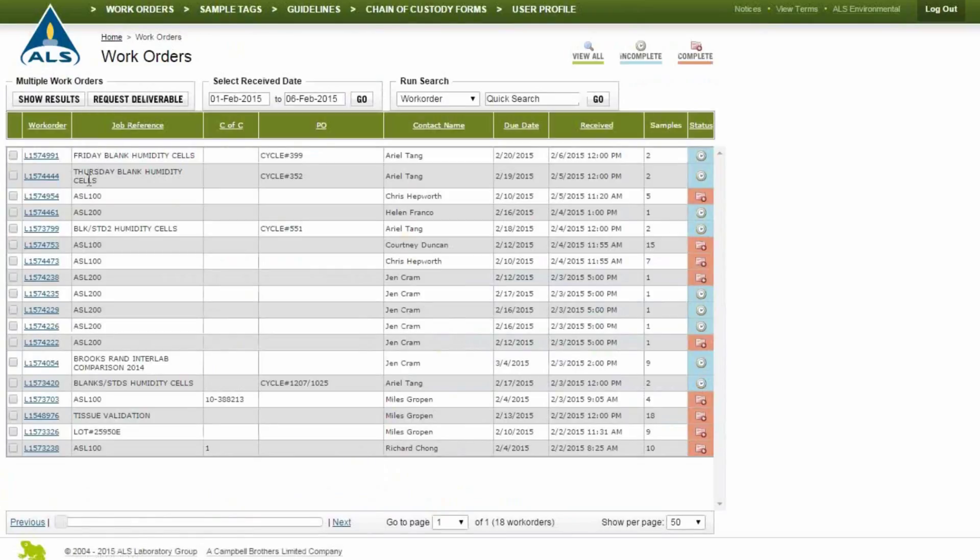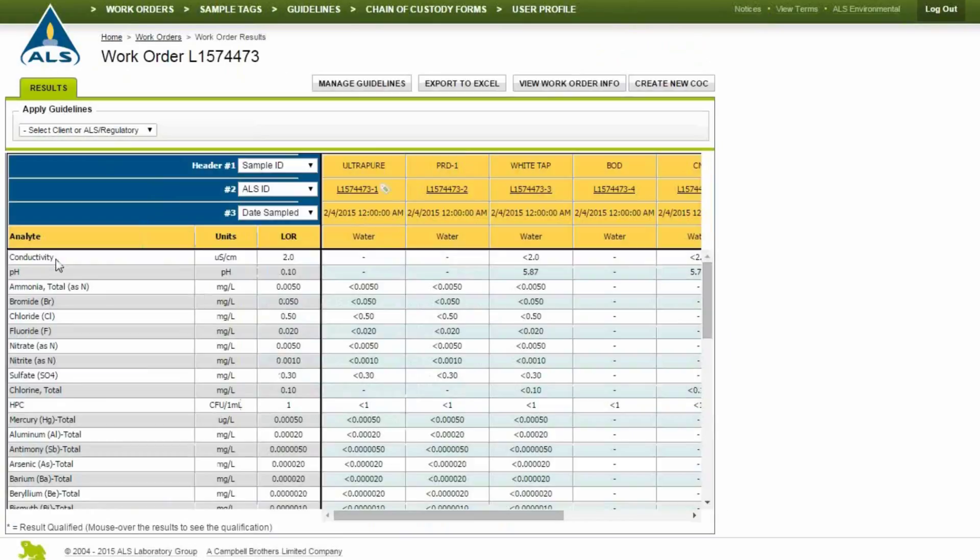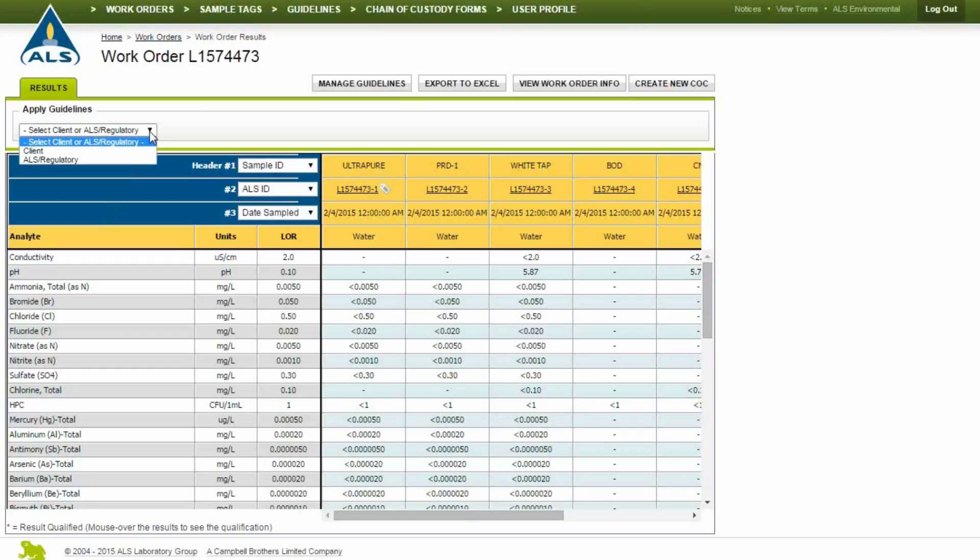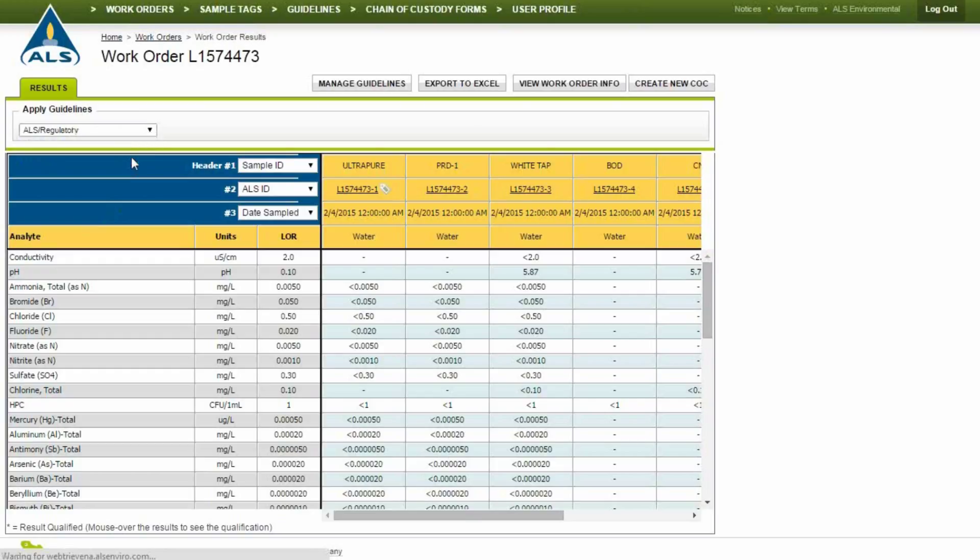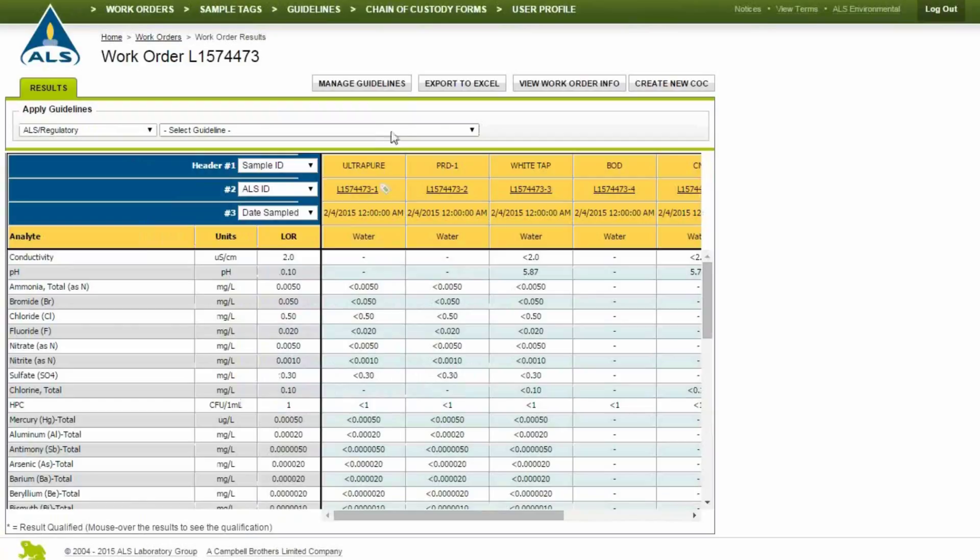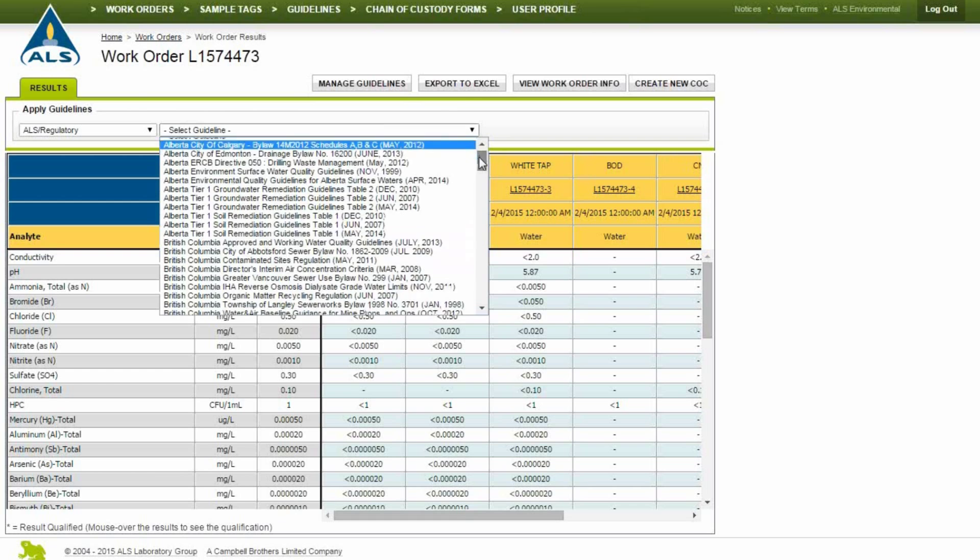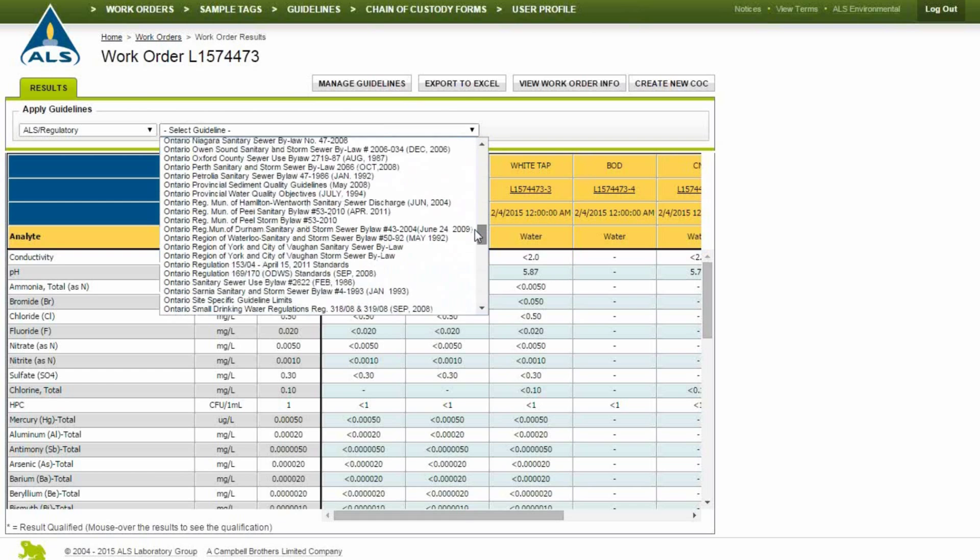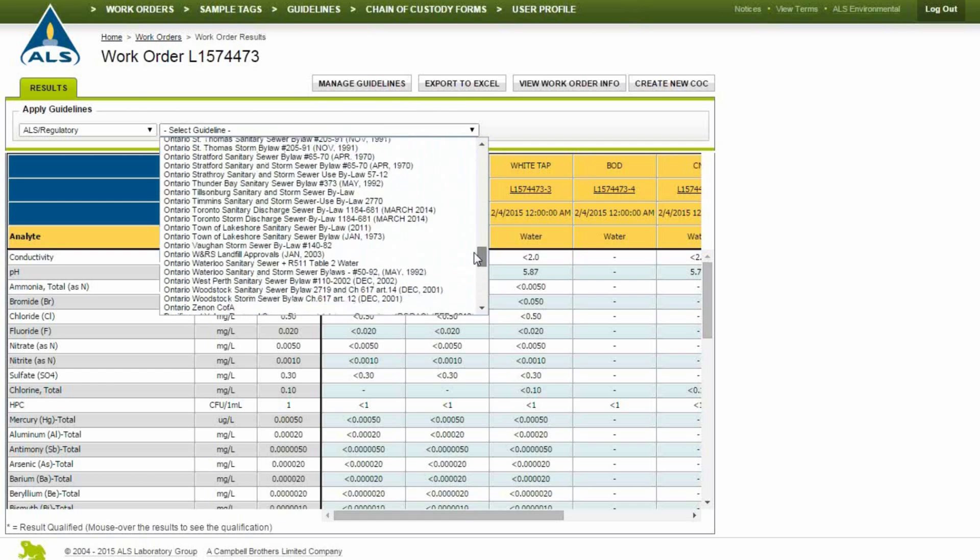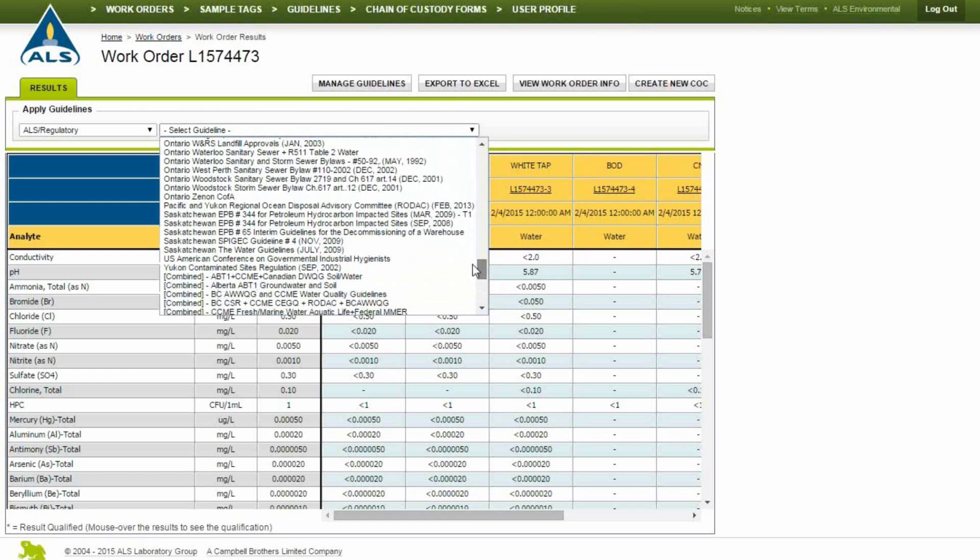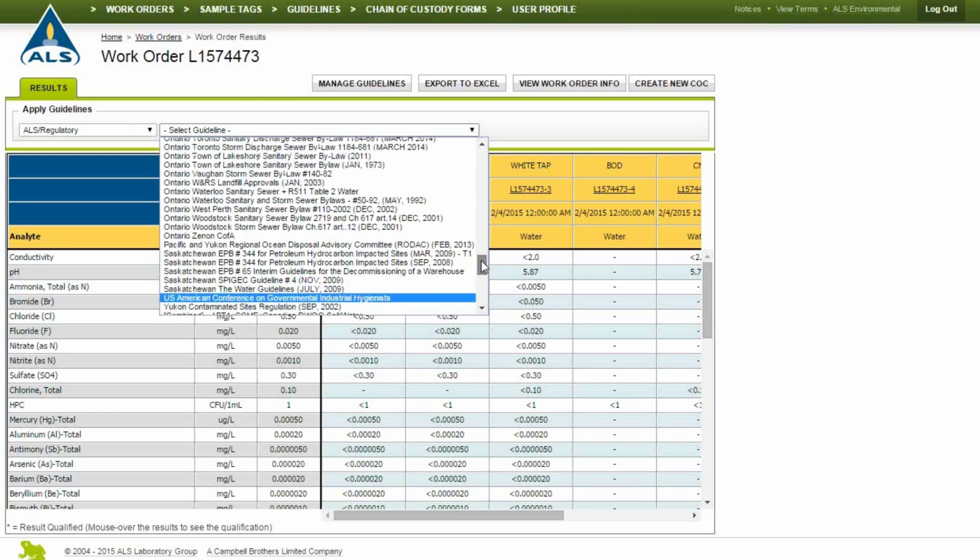Apply regulatory guidelines to an individual and multiple work orders using the Apply Guidelines drop-down menu. ALS regulatory guidelines are populated and controlled by ALS. Each guideline includes the creation or last edit date in parentheses. Combined guidelines, which are listed near the bottom of the drop-down list, are common combinations of guidelines created by ALS.